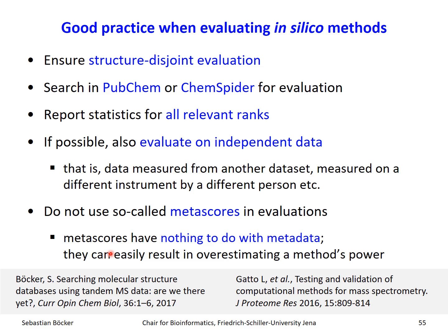Now, doing a good evaluation is really important, and actually papers have been written about that because we often see other papers where it's not been done in this way. And as I said, in the fields of bioinformatics and machine learning, this is not something that you even discuss, okay? People from machine learning or bioinformatics might not be aware of that, but everything else is clear. Okay, that's how you do it. But sometimes on the chemical side, we see papers where we were really not happy with it. This is not something where we can say, oh, yeah, not perfect, but who cares? This is really the minimum standards that we should adhere to.